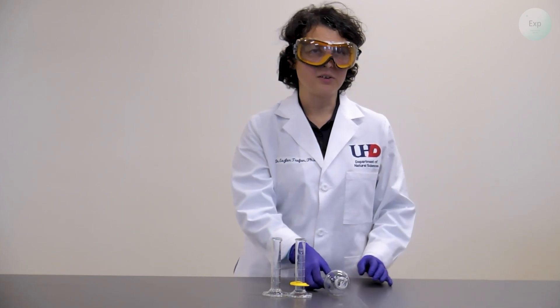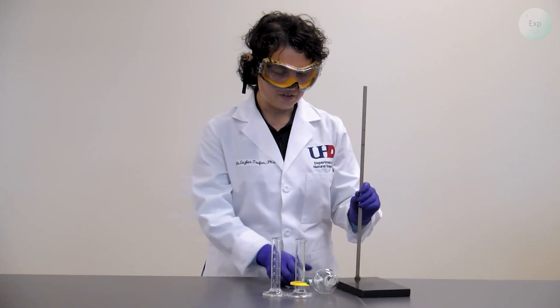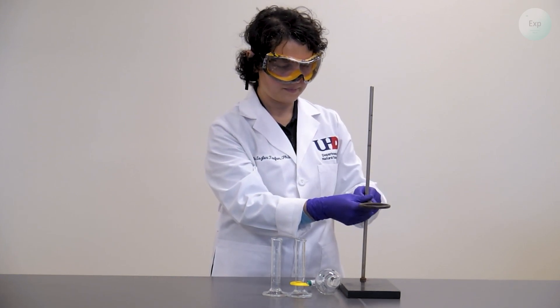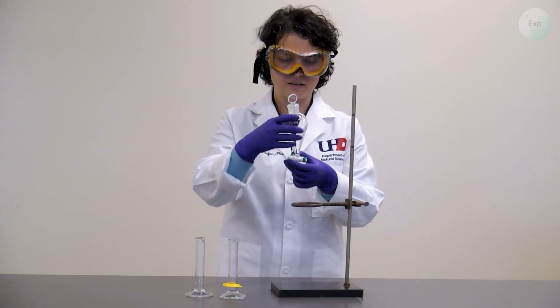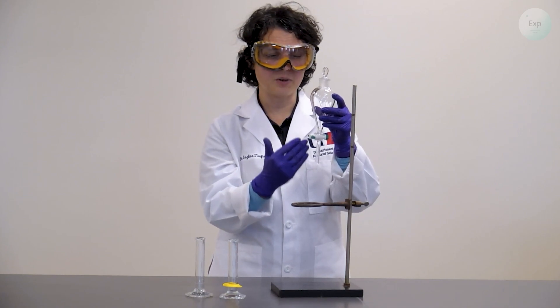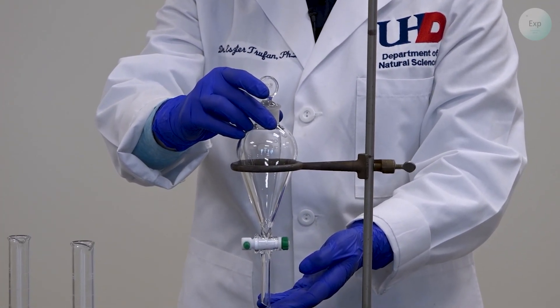A separatory funnel always needs to be suspended from a stand. I'm going to use a stand, and to support the separatory funnel I will also need to use an O-ring. You want to have your separatory funnel in the closed position where the valve is perpendicular to the direction where the liquid would flow, and the cap should be on top, closed. Gently lower it, and it should be completely supported by the O-ring.